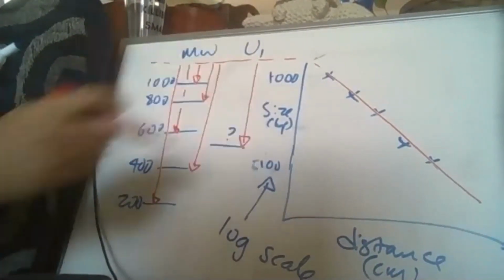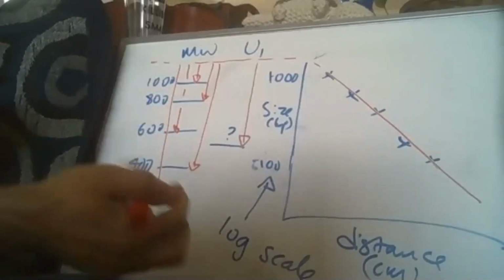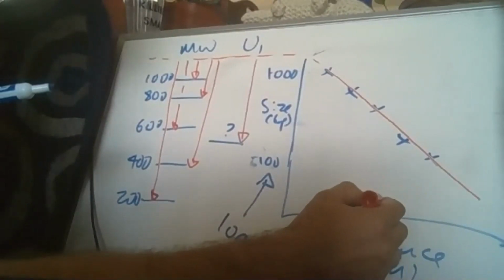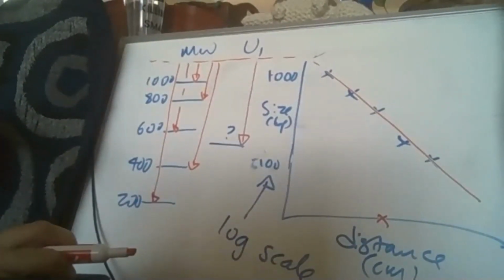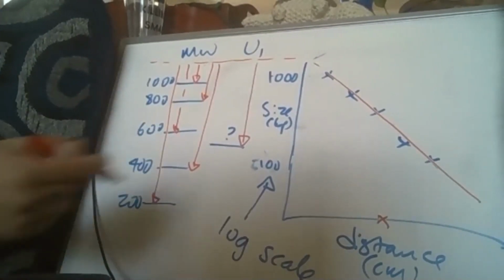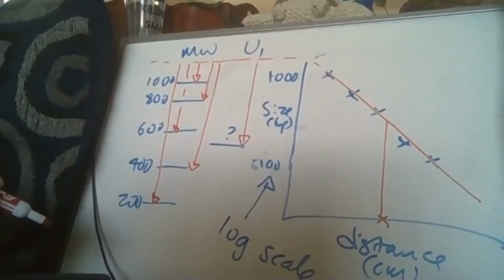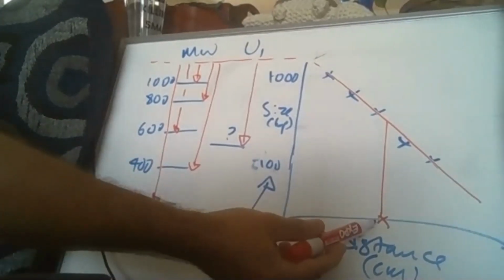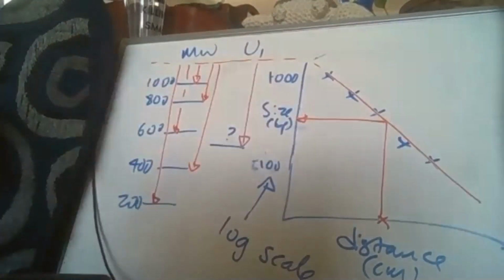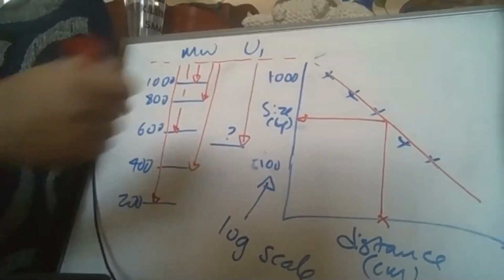And so then you measure the distance that your unknown has moved. That gives you one piece of information, which it would be, say, here. Right, it's going to be a value in between these two, right? Because that's where it went to on the gel. You then draw a line up or vertically from that point on the x-axis and along, and you read out, I don't know what that would be. That'd probably be like 525, let's say.